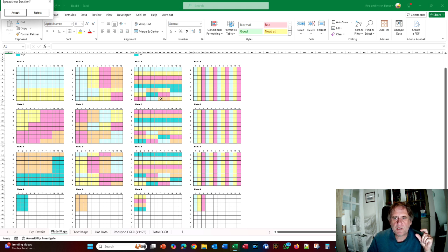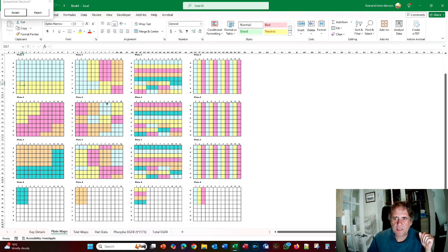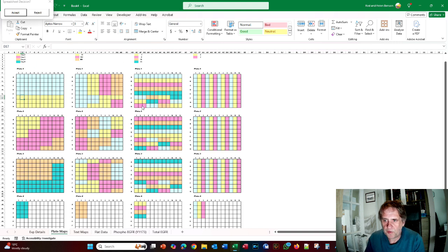So you now have these 4 bits below, which are 3 by 3 squares, and that's how this bit fills in. So it puts these first 3 time points, then there's next 2, so you can see those go out of sync, and this gives you quite an interesting dose distribution, quite a mess. Then you can see that the main part of compound 2 starts here. But obviously it does lead to quite messy plate maps, which of course is not what you want.